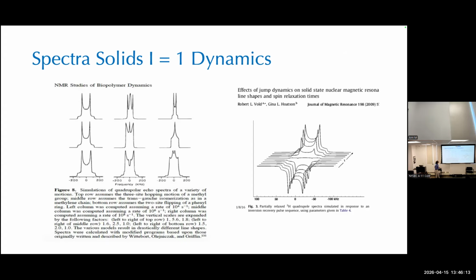But if that functional group moves and has a characteristic hop angle, then as the temperature or the rate of the hop goes up, you can start to see some really interesting line shapes. And this, in my opinion, is the right size anisotropy to get some really dramatic window into dynamics.